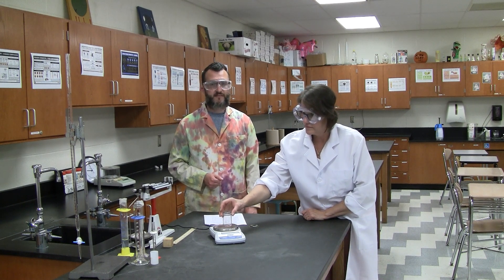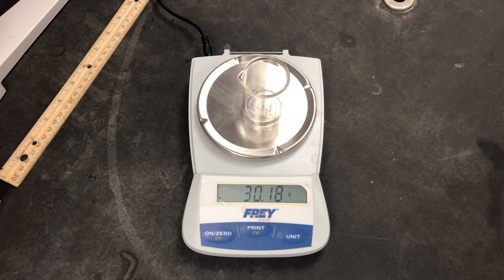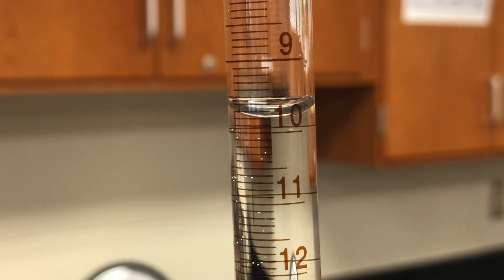Next we pour water from the graduated cylinder until it fills all of the plastic cylinder. Record the new volume of water in milliliters — you know what to do with that extra digit. The difference between the two volume measurements is the amount of water used, which is also the volume of the plastic cylinder in milliliters.